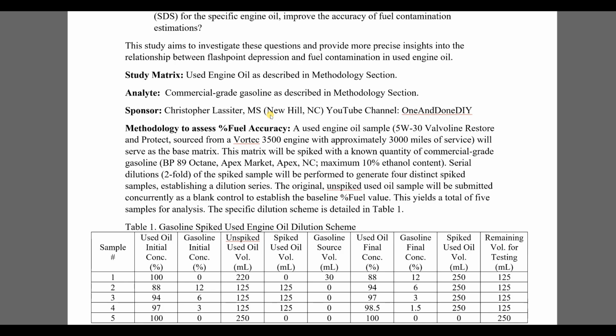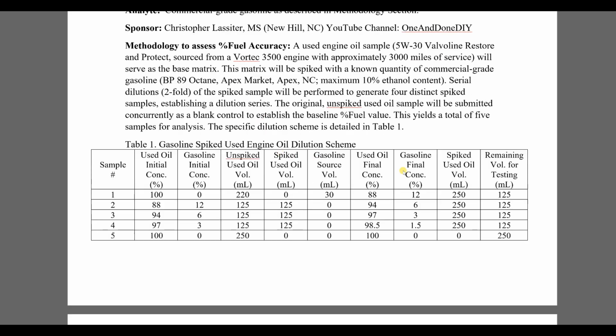And basically, a serial dilution, or what I want to call a controlled dilution linearity, is where I wanted to do a twofold dilution. So based on the fact that if you have 20 and then cut that in half, and then you have 10%, cut that in half, and 5%, it's just logical to do that. And here's the table here if you want to read.